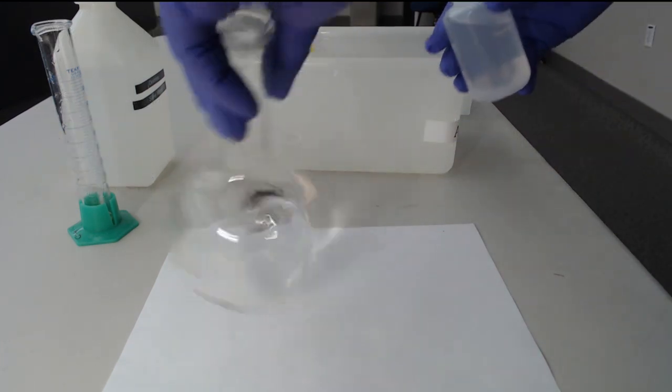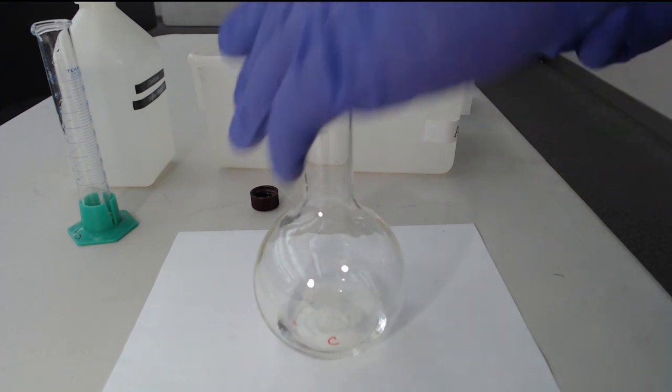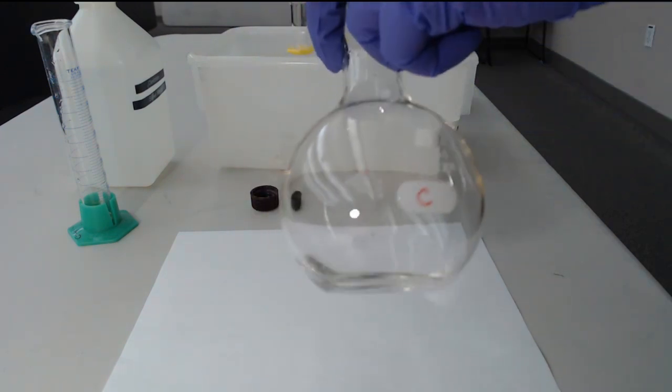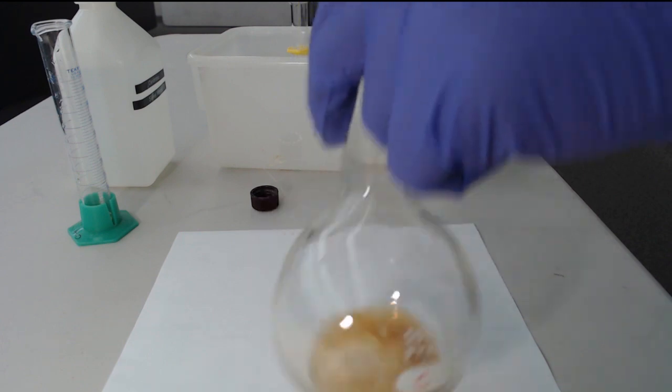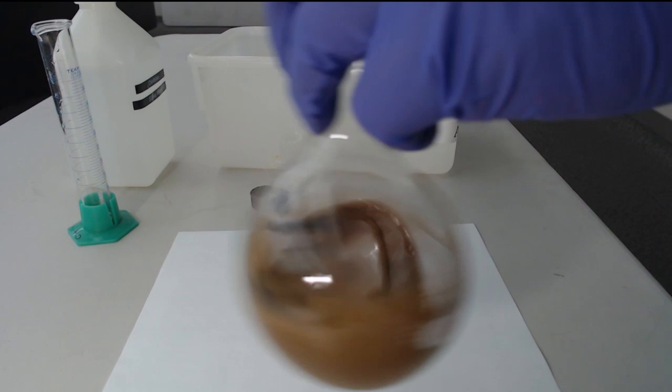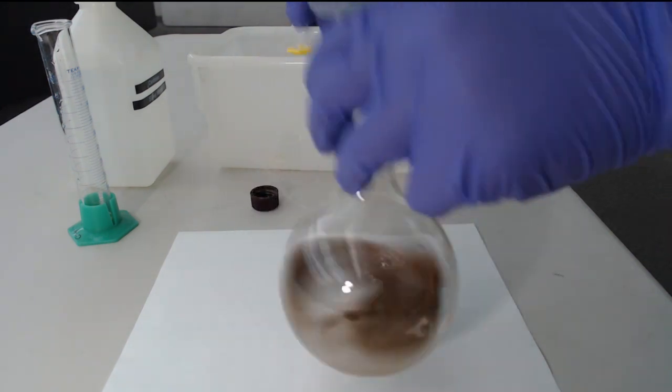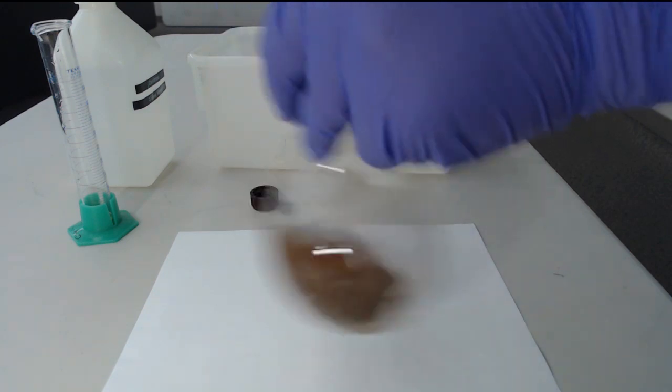And we'll see if we see anything happening as I add it to the silver nitrate, which is what's in here right now. And we should see evidence of a reaction. Oh God. You guys see anything? What happened? And that's precipitate formation, the solid.